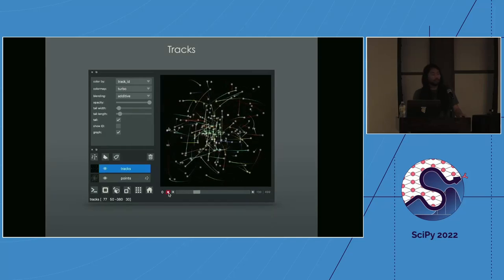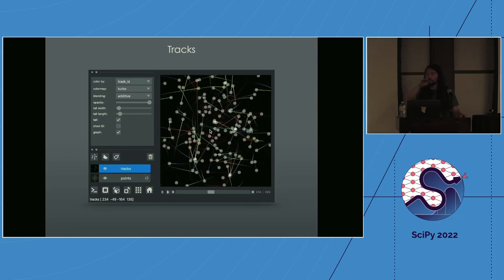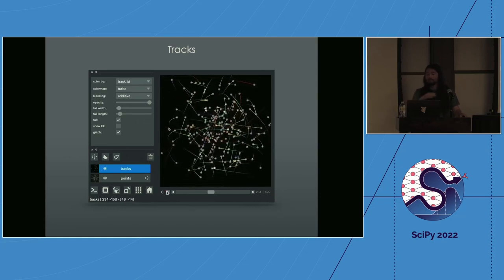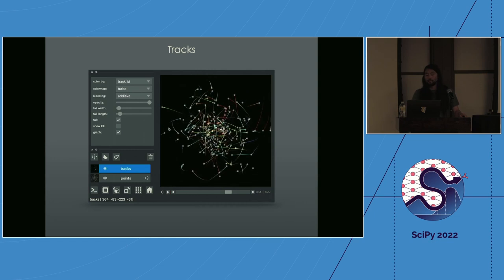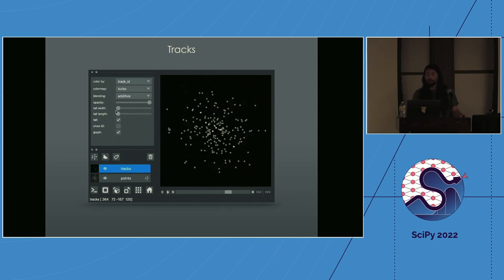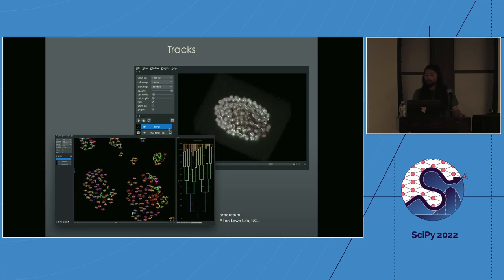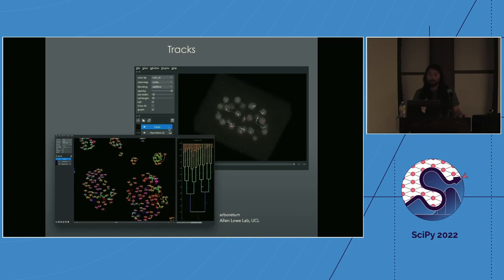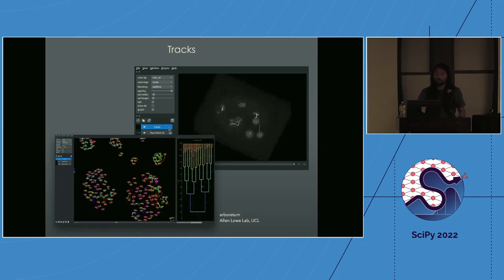The tracks layer is useful when you are tracking particles or objects over time — it adds a little tail under the particle that becomes lighter and lighter, showing the recent history of where it's been, making it easier to see how particles are moving together. This was contributed by community member Alan Lowe at UCL and the Turing Institute, who built a full application called Arboretum for tracking cells over time — a great example of a community member building something and contributing it back.